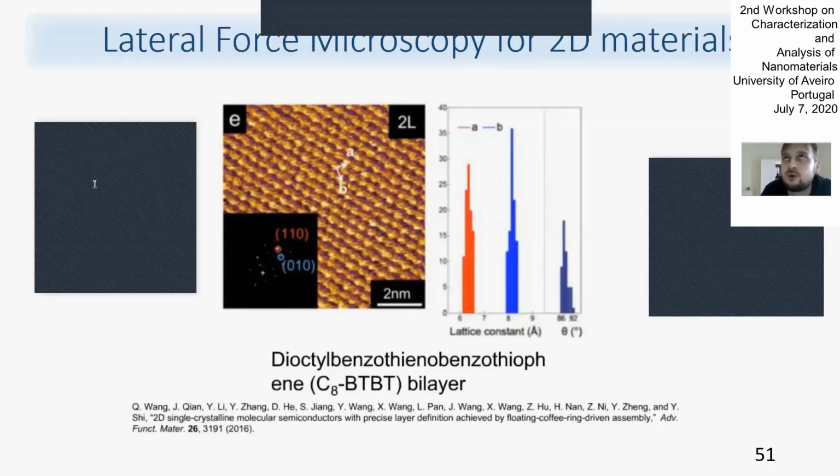For example, for contact measurements, I use not higher than 9-10 micrometers per second. For tapping mode measurements, I can increase it up to 15, 12, or 20 micrometers per second. This is also a very major point. If you do really fast scanning, you have a lateral force, and this lateral force will destroy your tip. Okay, thank you very much.